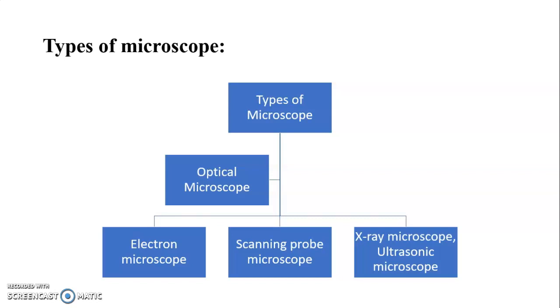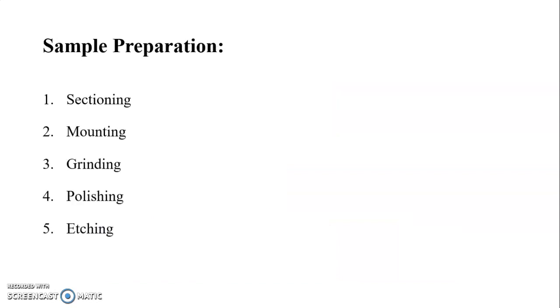These high speed primary electrons, when they fall on the specimen, produce low energy secondary electrons. In the detector, the secondary electrons are converted into electrical signals by a photomultiplier. The electrical signal is then amplified and displayed on the cathode ray tube. So this is the working of the electron microscope.